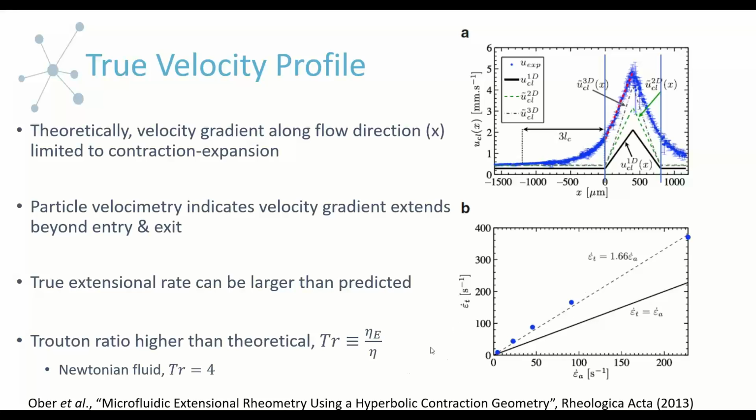So it turns out that our goal was to develop this simple flow channel, and in the general sense, it is simple, but we're not getting quite what we had hoped. So that's fine. It's just important to know that this is occurring and what it means to certain experiments that you want to do. One of the experiments where this is relevant is when you need to confirm the performance of your flow channel.